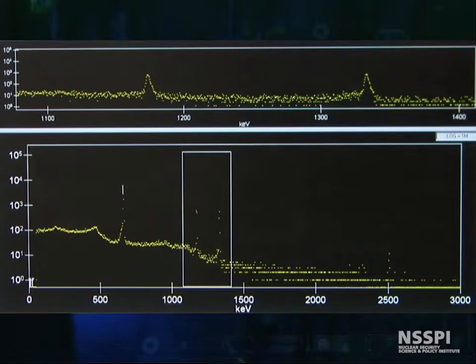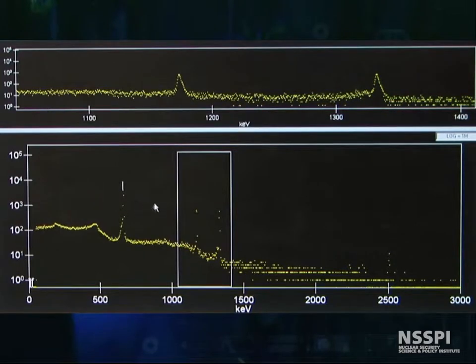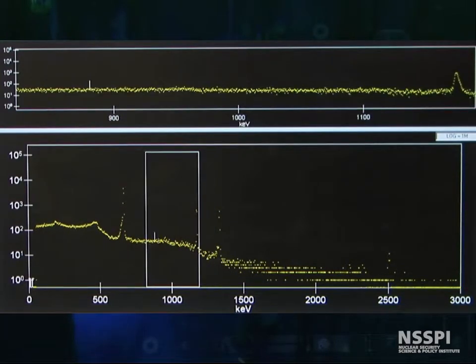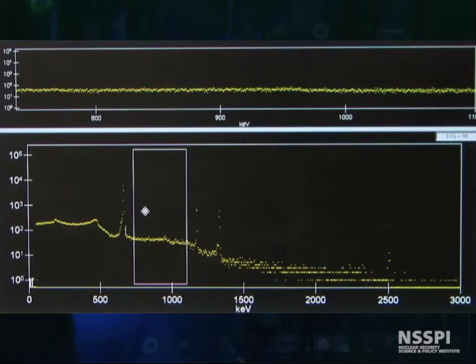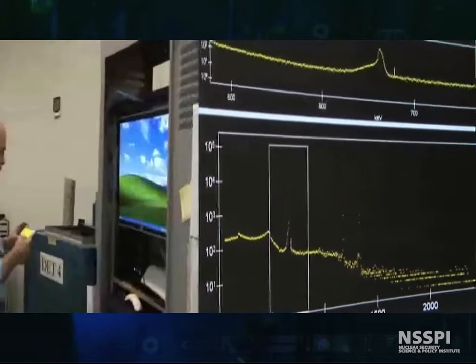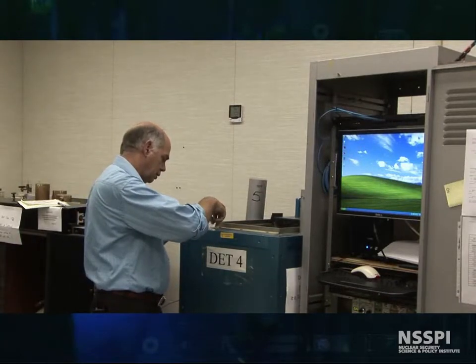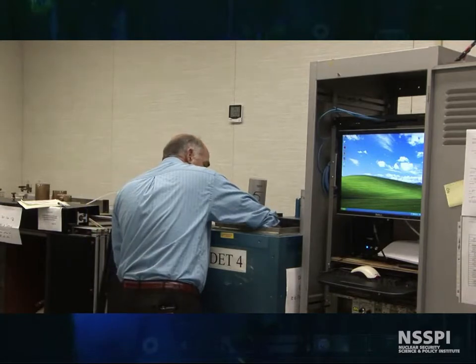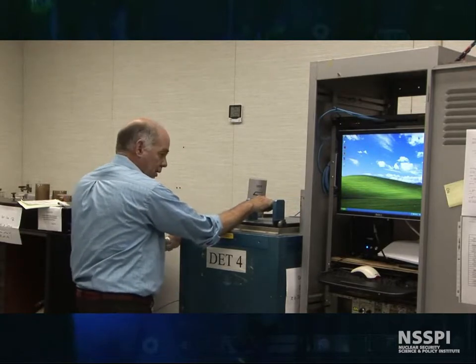To construct our absolute efficiency calibrations, we're not going to use these check sources. We have a europium NIST traceable source, and we're going to put that in and construct the absolute efficiency of our detector for STAN3. Here's our mixed gamma NIST traceable source. Now we have a dozen lines that are going to show up on our spectrum that we can use to do a complete energy calibration and an absolute efficiency calibration.